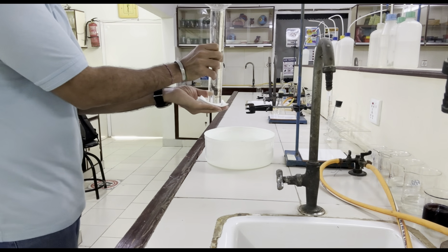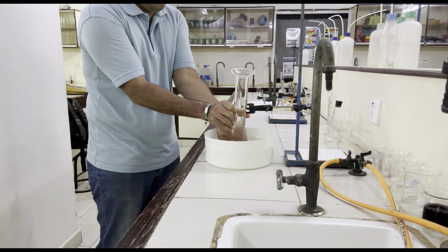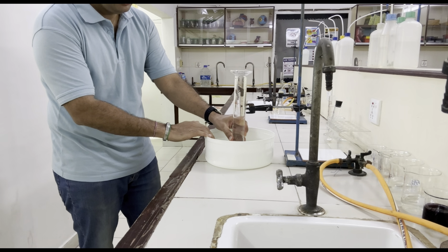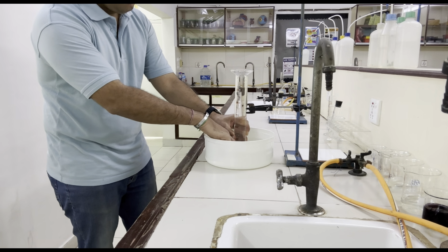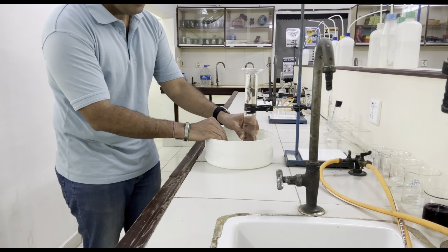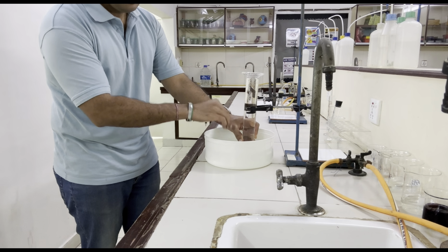And then I will take this into this water bath, and you can see there is no air bubble inside the water in the measuring cylinder. Now let me place this here. Before we place it here, let me show you that this is the tap. It is attached to the bottom.